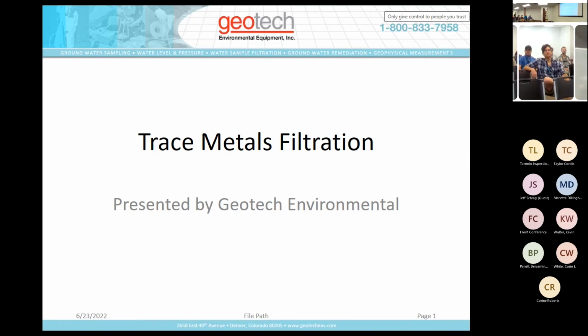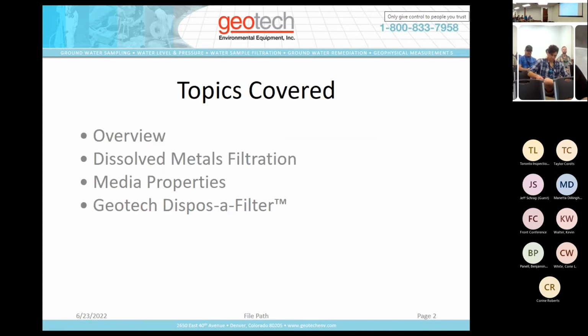I know we're up against the time to go to lunch, so we'll get through this and get you guys off. We're going to talk about filters, kind of the overview, dissolved metal filtration, the media properties, and then the products that we actually have for our filters.